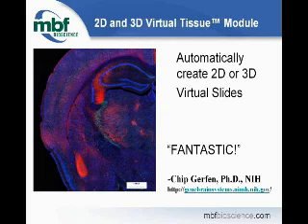Chip Gerfen at NIH is one of our early adopters of 3D virtual slides, and he's creating many of them. And this is a maximum intensity projection of many fields of view that have been stitched together to make a seamless montage. Also, if you've been working with virtual slides in the past, you know that we had certain image size issues. Those have been overcome with our new way of capturing virtual tissue. So what was difficult to acquire can now be acquired with our new virtual tissue.